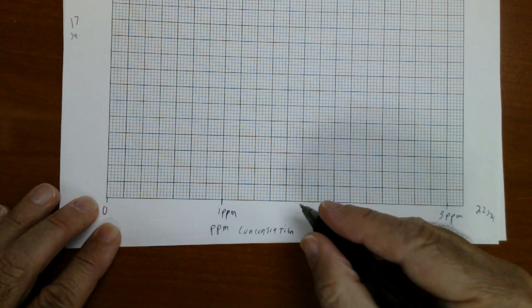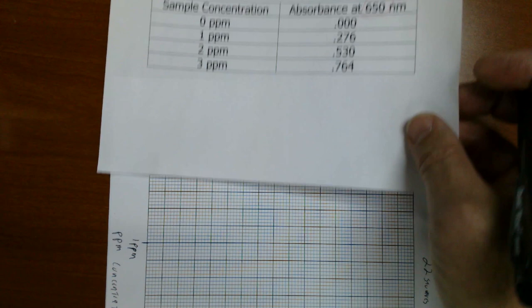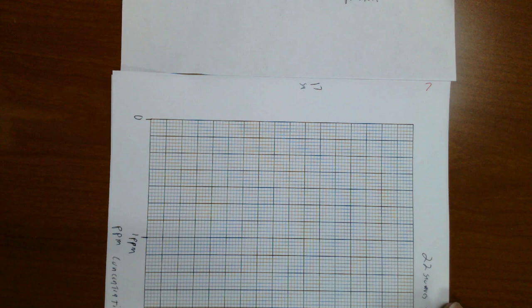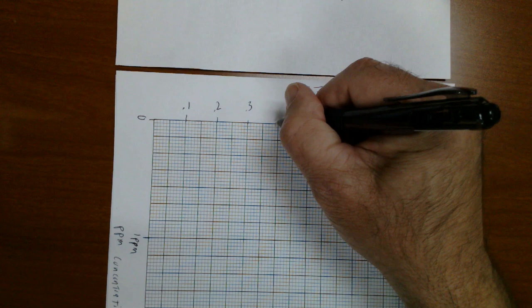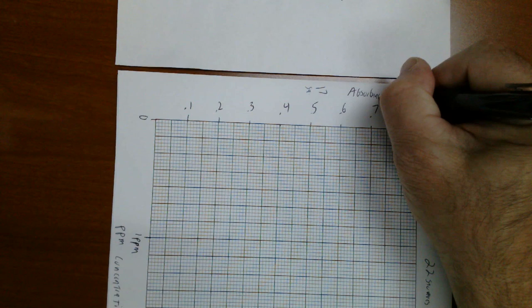And on my y-axis, I'm going to enter the absorbance values. When I counted the squares on the y-axis, it came out to 17 squares. And our range of data is from 0 to 0.764. So if I use 0.05 per square, I'm going to use most of those squares. So I'll label every 0.1 absorbance unit as 2 squares. And this is going to be absorbance at 650 nanometers.